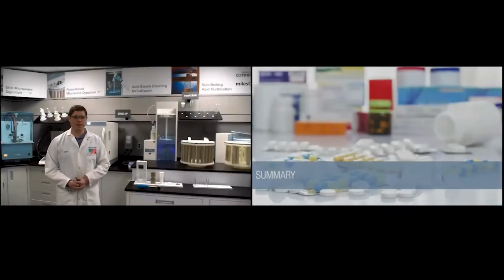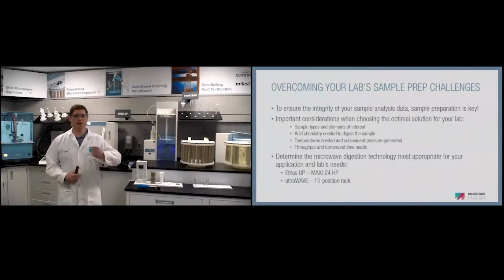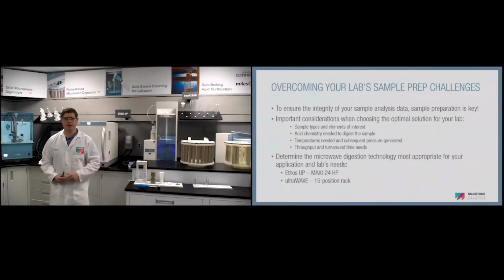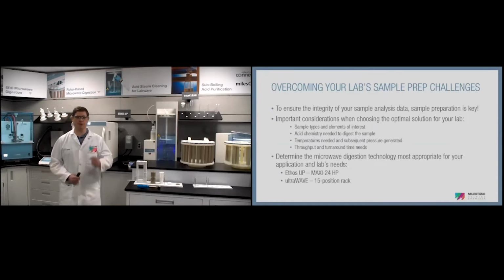So thank you very much for your time today. I do want to just summarize some of the topics that we went over. We did go over a lot. Of course, making sure you get quality analytical data all starts with the sample prep part of your process. So you want to make sure that you get a good digestion, which will give you good results on your Agilent ICP-MS. You want to consider a few different things when you're choosing the right system, not only sample types, temperatures, and pressures needed, but also throughput. How well will the system work in your lab? You don't want this to be a bottleneck, but you really want it to be a tool that helps you with your analysis.